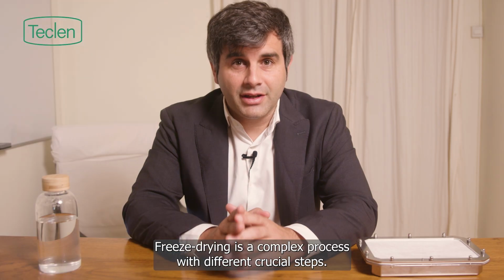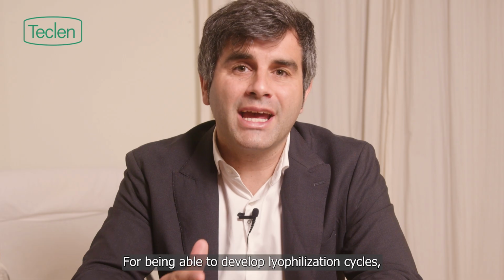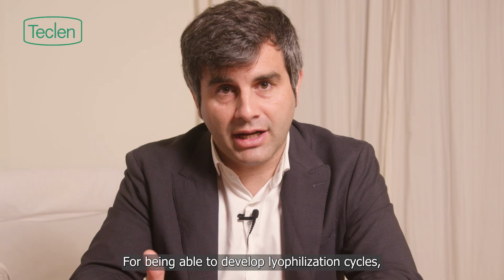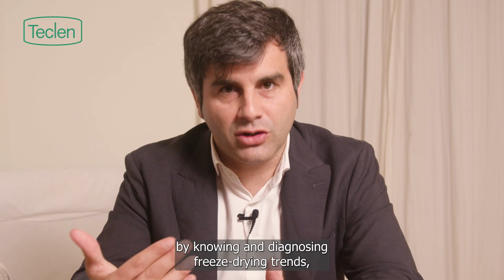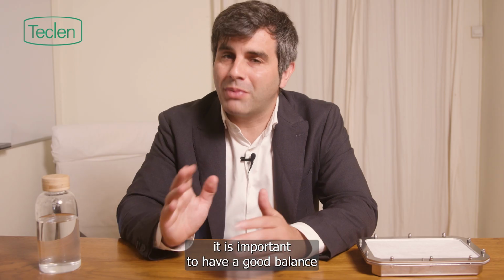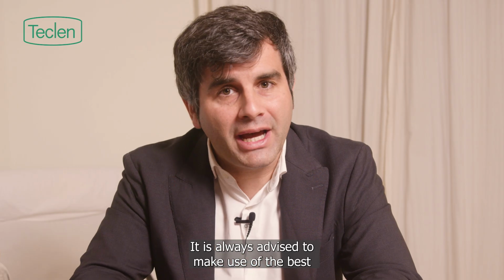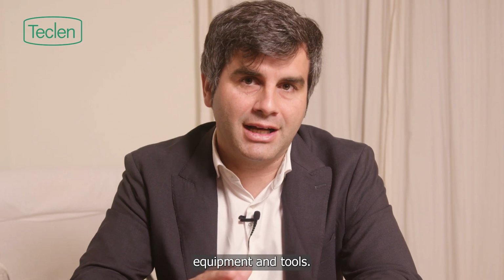Freeze drying is a complex process with different crucial steps. For being able to develop lyophilization cycles by knowing and diagnosing freeze drying trends, it is important to have a good balance between technical and scientific skills. It is always advised to make use of the best equipment and tools.